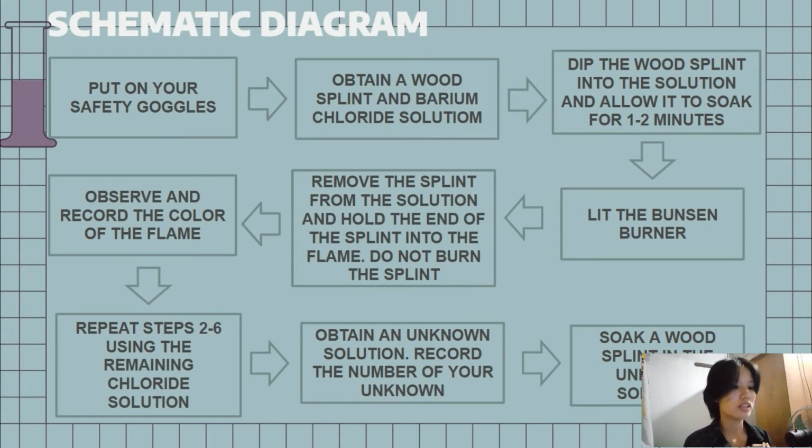During the flame test, we need to wear goggles to protect our eyes. Additionally, for girls with long hair, you need to secure your hair with a tie.